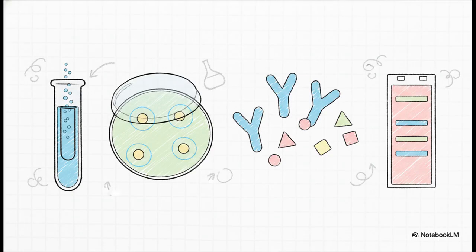All right, once we have that pure subculture, the real interrogation phase begins. We need to systematically gather high-yield diagnostic data to uncover the pathogen's vulnerabilities and its genetic signature. We run biochemical profiles to track unique metabolic reactions, sugar fermentation, and gas production using those little inverted Durham tubes. We figure out drug sensitivity by culturing the pathogen with different antibiotic discs to map out zones of inhibition, basically seeing which drugs actually kill it. We also use advanced immunological assays like targeted antibody-antigen kits. And, of course, we sequence the molecular data, running PCR or gel electrophoresis to isolate highly distinct DNA base sequences.